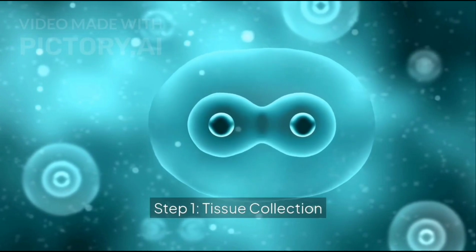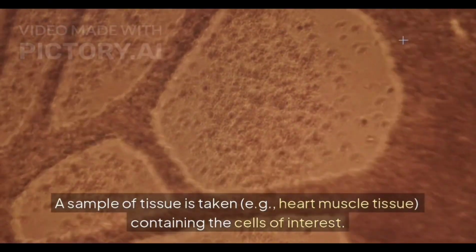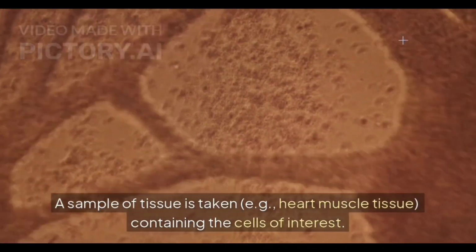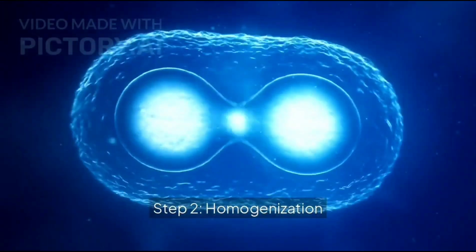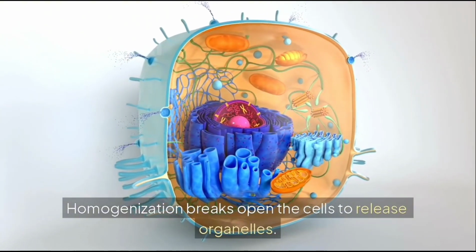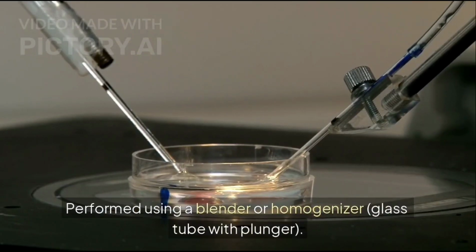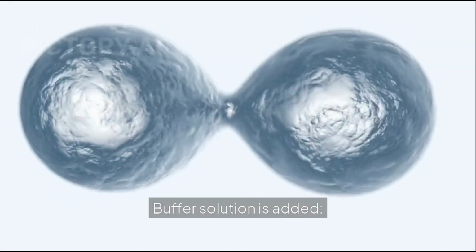Step 1. Tissue collection. A sample of tissue is taken, for example, heart muscle tissue containing the cells of interest. Step 2. Homogenization. Homogenization breaks open the cells to release cell organelles. It is performed using a blender or a homogenizer, which is a glass tube with a plunger.